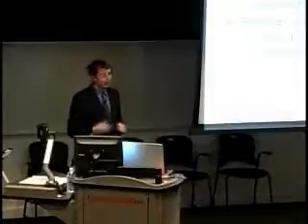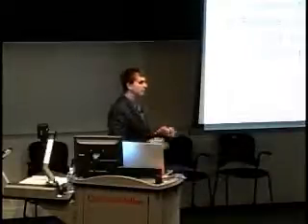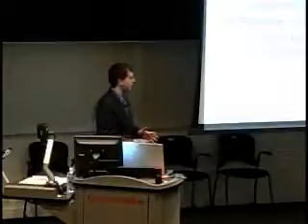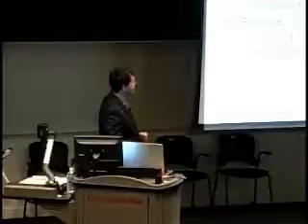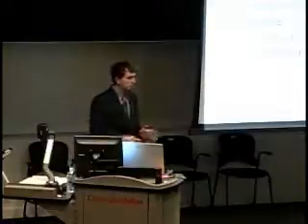For future work, we are already working on a GPU client-server architecture of NeuroTrace, which is going to be useful so that we can run NeuroTrace on a laptop or a lightweight computer without having a powerful GPU. And we're also trying to implement on-the-fly stitching and registration so that we can have stitching, registration, segmentation, and visualization in just one tool.